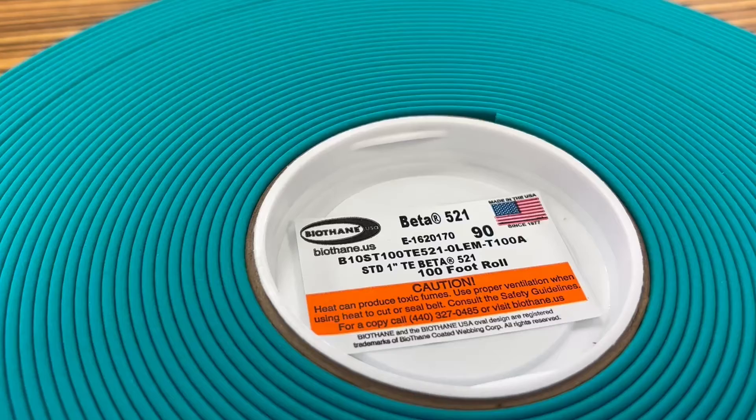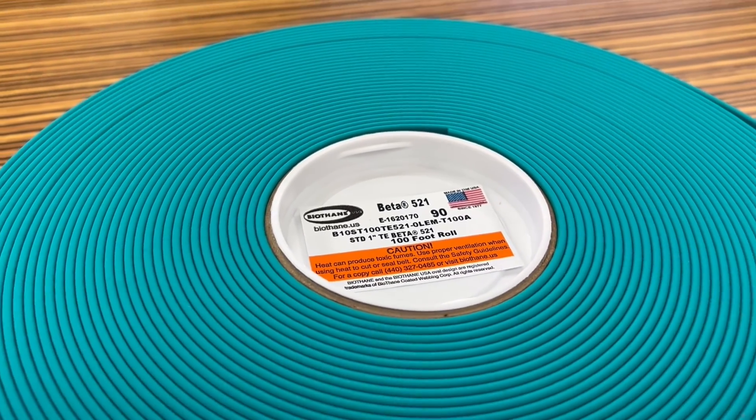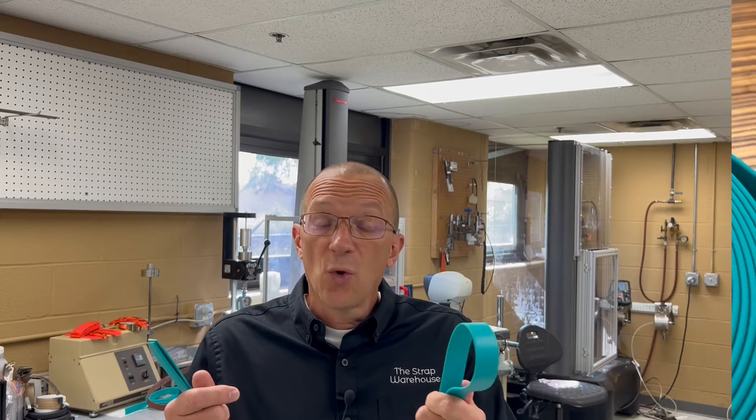Now let's get to the fun stuff. We're going to conduct the same test on three different samples. First we will test the tensile strength of a control sample. The control piece is a piece of B10, it's beta standard, that has not had any punching or sewing done to it.